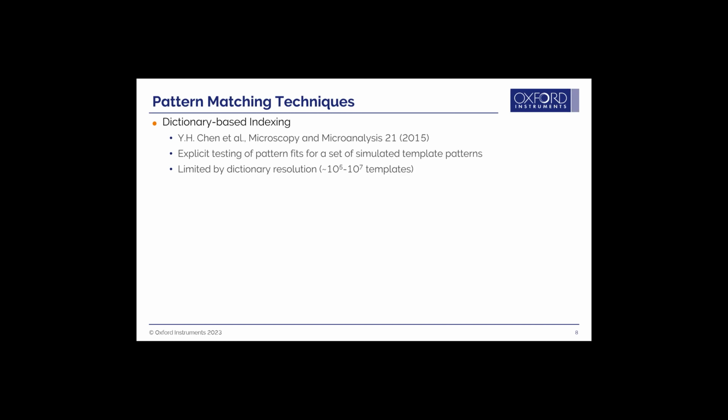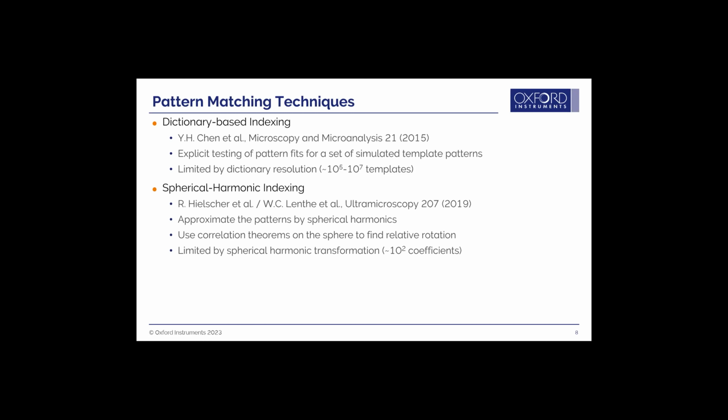You can imagine when you get to lower symmetry patterns, you're going to have to build a pretty significant library here. So that technique was introduced. It was an interesting idea, but ultimately the practicality of it was poor. It was going to take quite a bit of time to set up and then even run, and that was even on heavy duty computing.